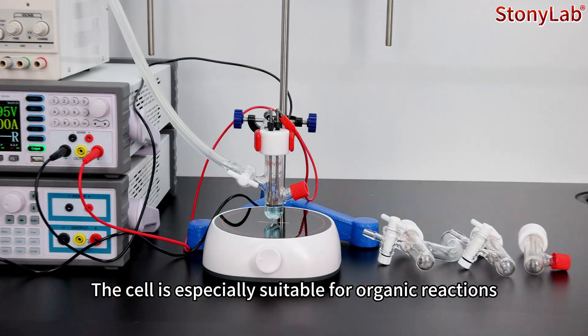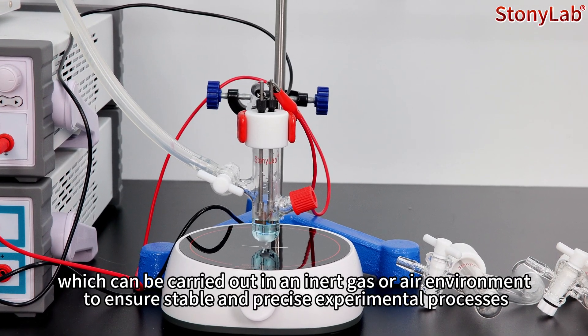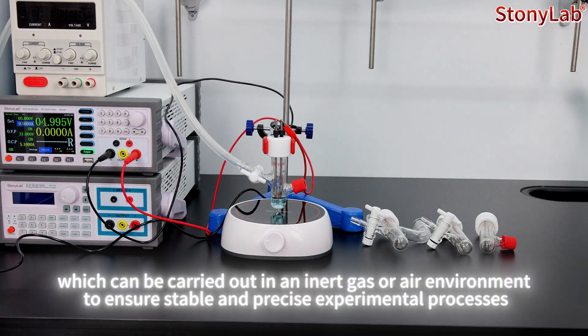The cell is especially suitable for organic reactions, which can be carried out in an inert gas or air environment to ensure stable and precise experimental processes.